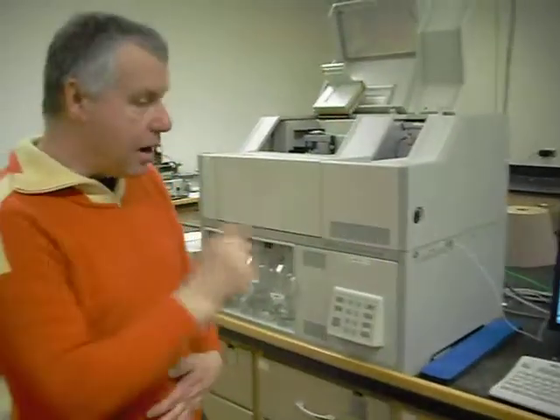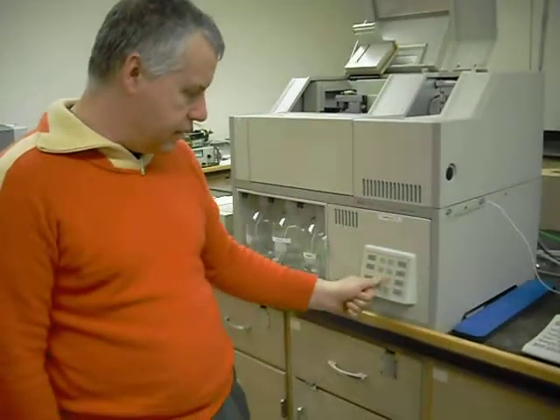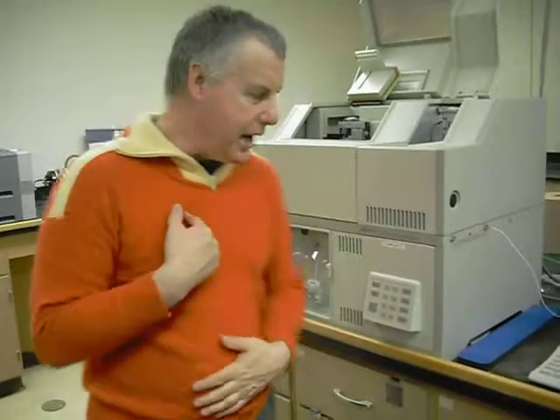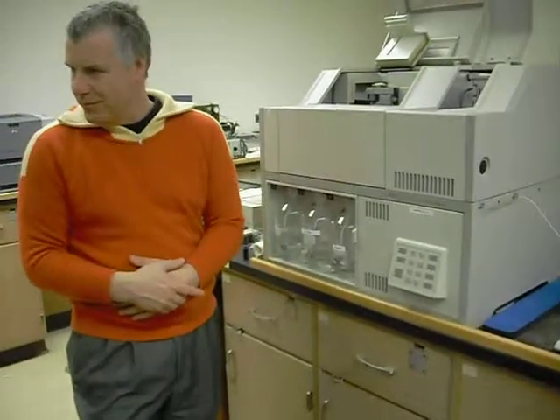I'm ready to set up a calibrated run, and everything should just print out as it goes. You can set it and forget it because it has a shutdown in the sequence. Now, because I'm not going to run a sequence right now, I want to make sure that I turn the detector and the pumps off before I walk away, because I will forget, and then we'll pump out all the solvents into the waste. Okay?